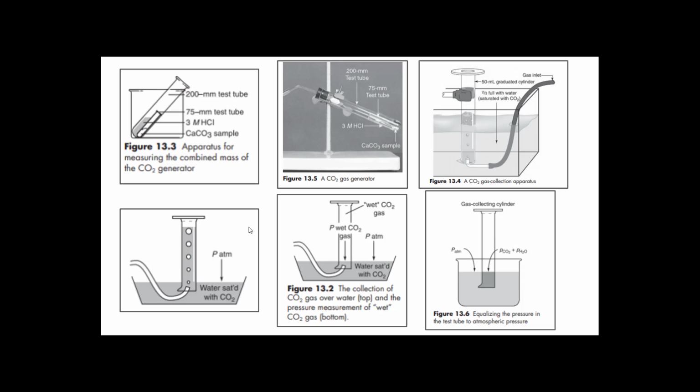The generator is what throws people off, because you think of an electric generator. In this case, it's generating CO2, so that's why it's called a generator. So if you look at this first box, and I took this all from the lab, like I said, this is a lab that we do in person.